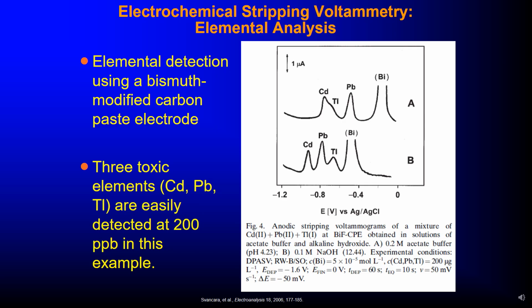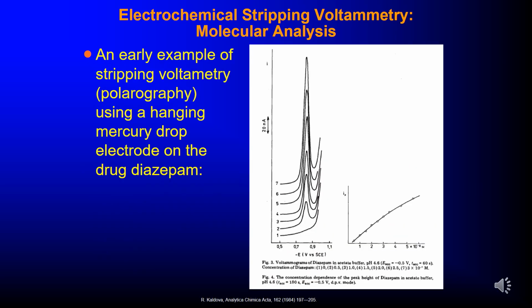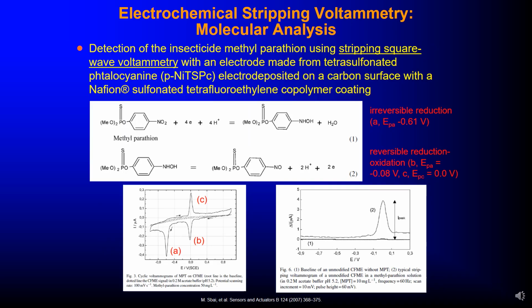I think those ones have some things you can see there. Yeah, you can see methylparathion and so on and so forth.